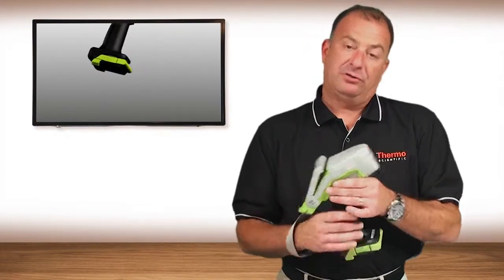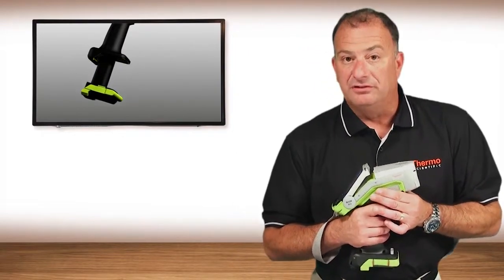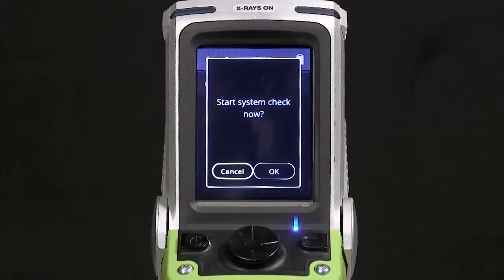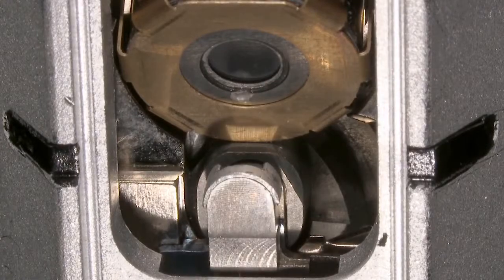It also has a hot-swappable battery that can be charged via UPS trickle charge or even a 12-volt DC source. The Nitron XL5 incorporates an internal system check standard — you're not required to have a separate sample in order to perform the calibration check. The standard is automatically rotated in front of the x-ray tube detector arrangement.